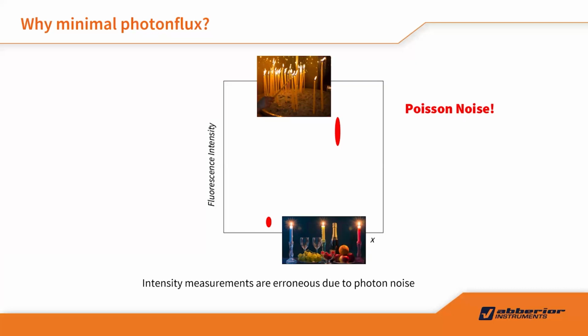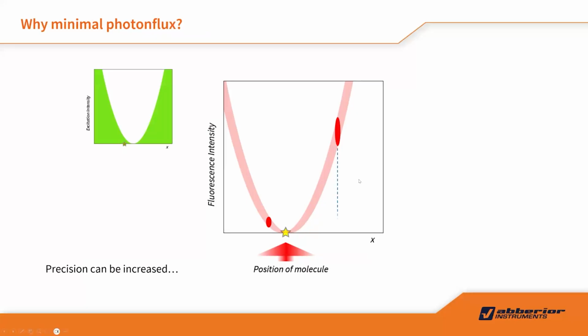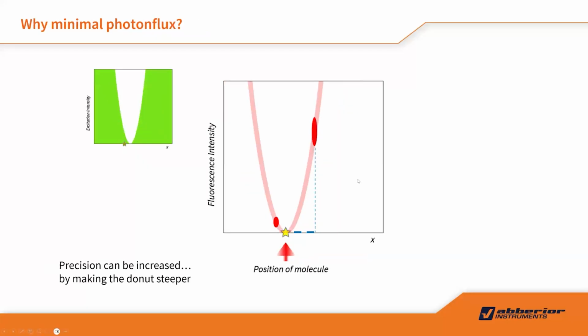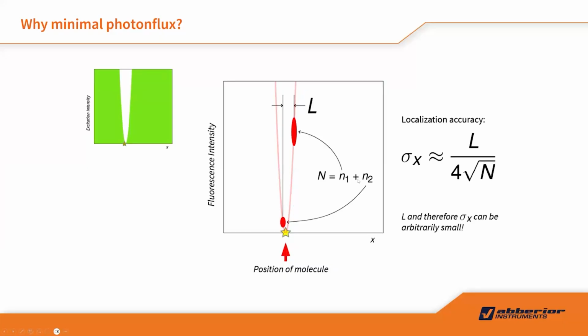Okay? Then if we do the mathematical fitting, as you can see, the Poisson noise actually will decide how the accuracy is. Therefore, if we try to reduce the error, as you can see here, with the same Poisson noise level, the distance sensitivity in the x-axis is more and more sensitive.